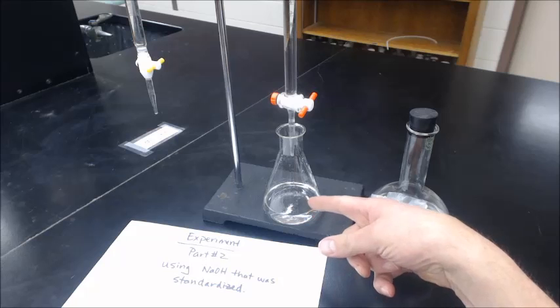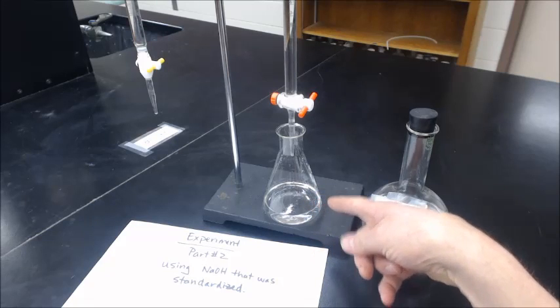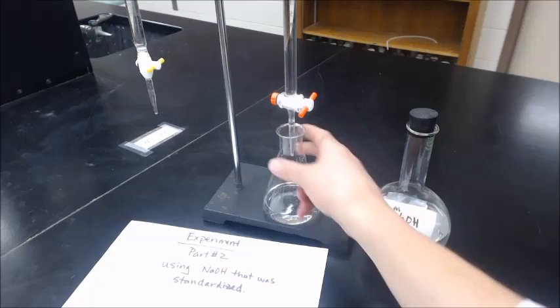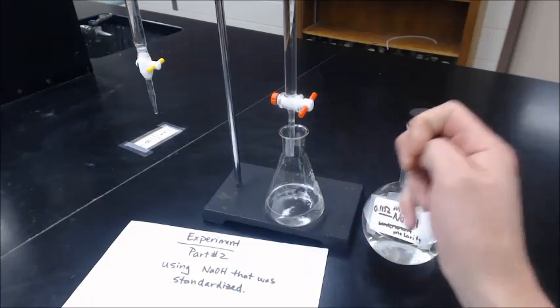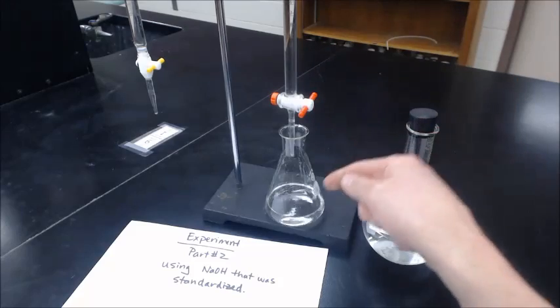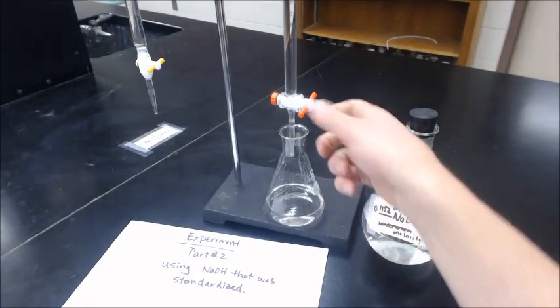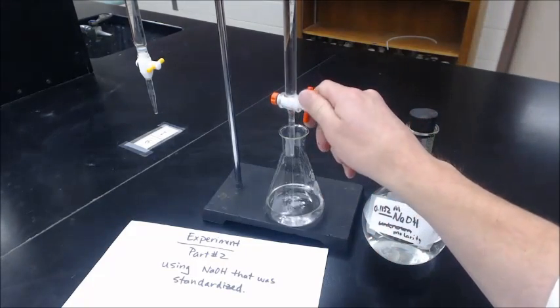You'll be given an unknown acid as a solid powder that you'll weigh out, and you'll add it into an Erlenmeyer flask. Mix it to dissolve with some deionized water. Add in some phenolphthalein, about three drops, and then titrate to the end point when it turns pink.